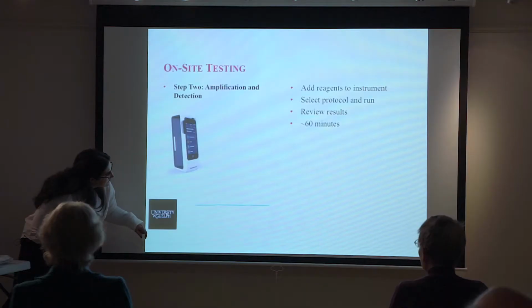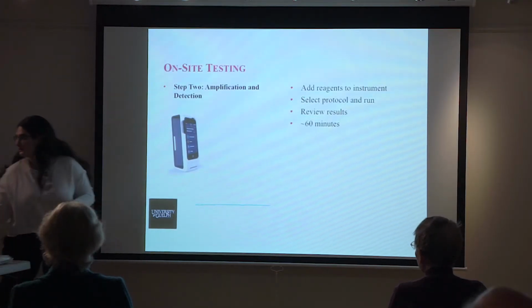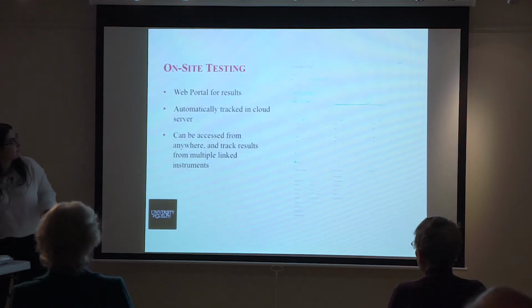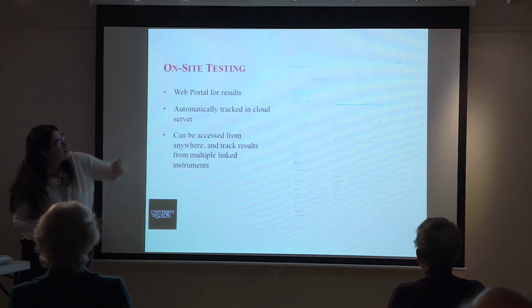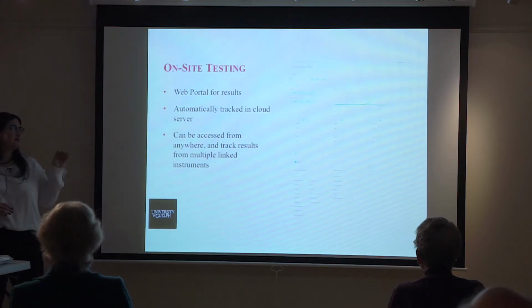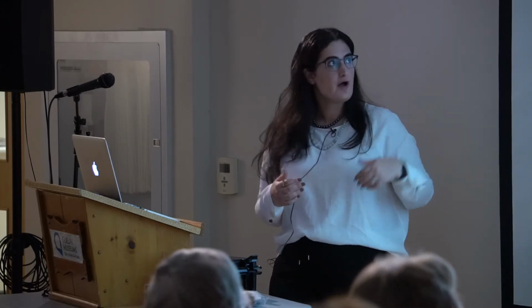And it's a little bit hard to see on the screen here, but this is a graph of, maybe it's easier on the other one, a little bit. So you can kind of see the curves that are showing up there. Basically, that's an indication that there's a positive sample, that there's some amplification happening. That just means that that fluorescent probe that I was talking about is actually amplifying something. If it was negative, it would be completely flat. So it's really simple to interpret whether you have your Atlantic salmon or not.